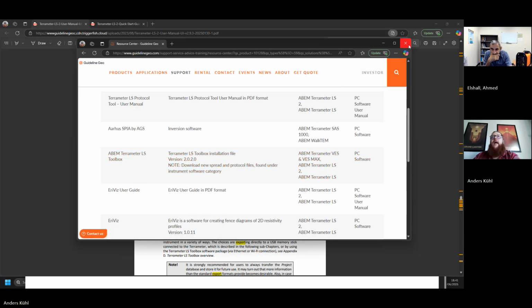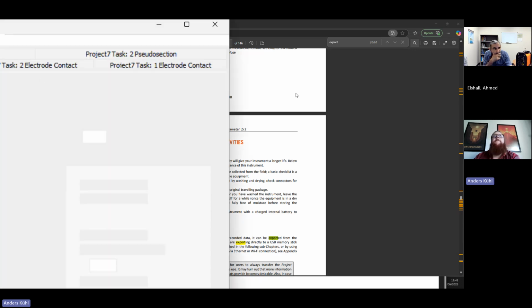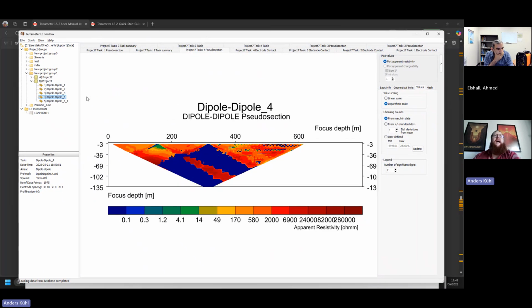This is the software that allows you to access and get some information about it.